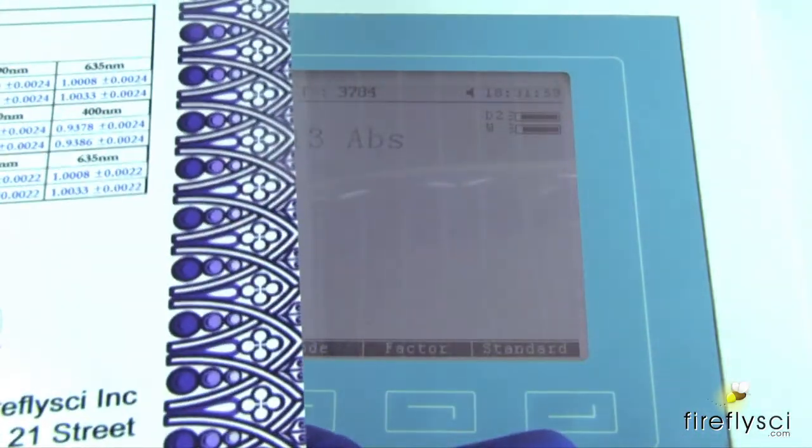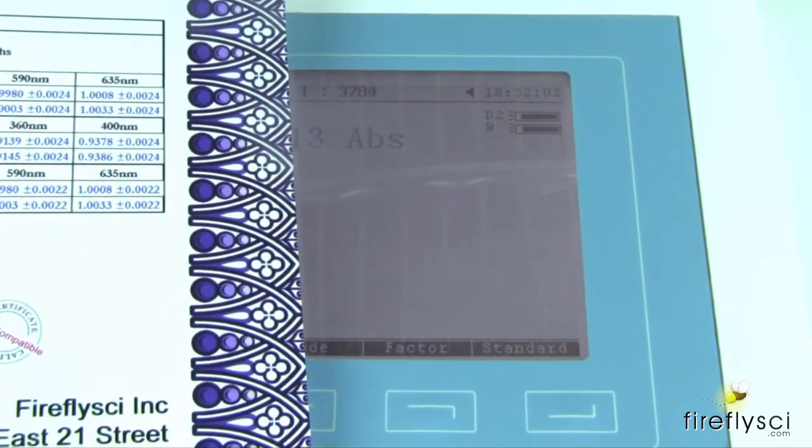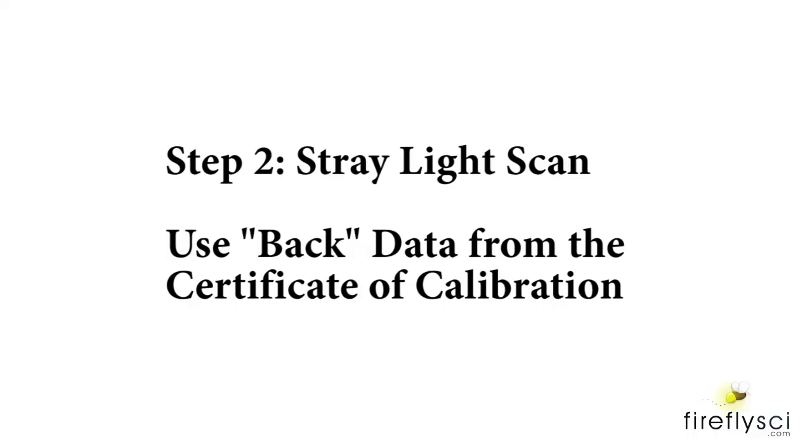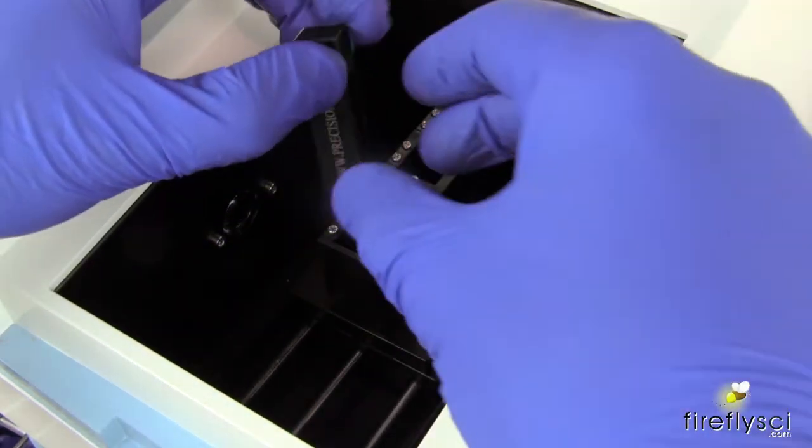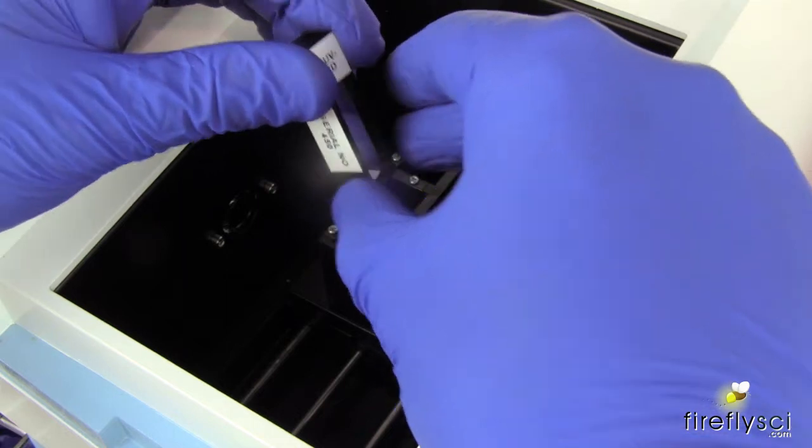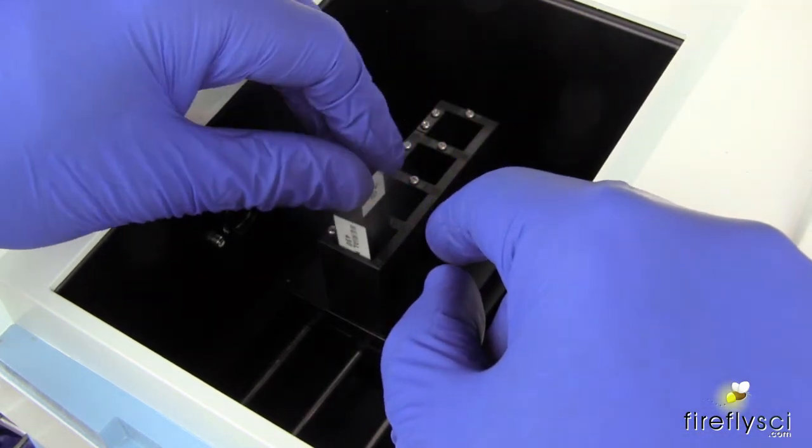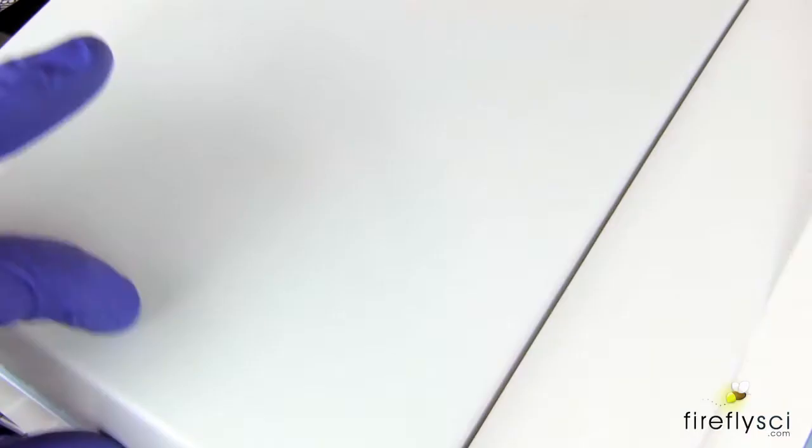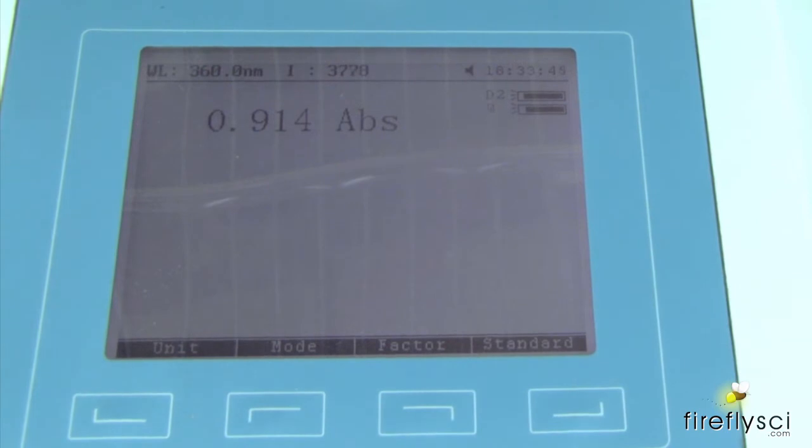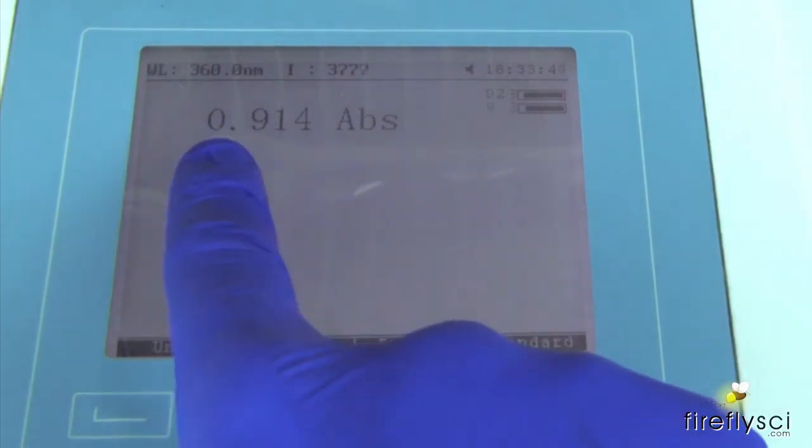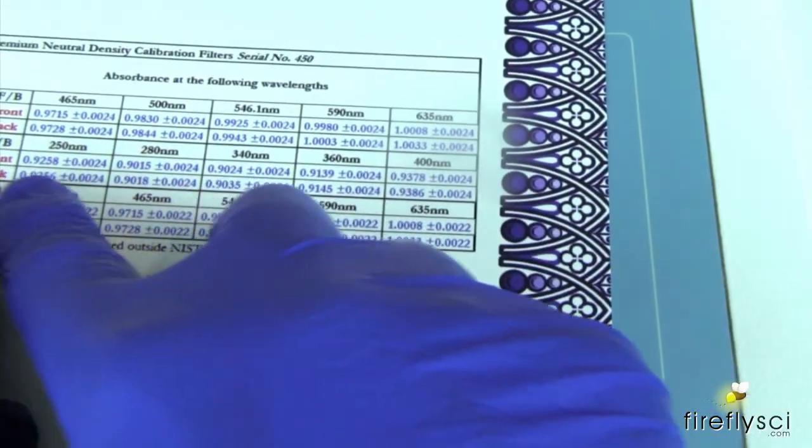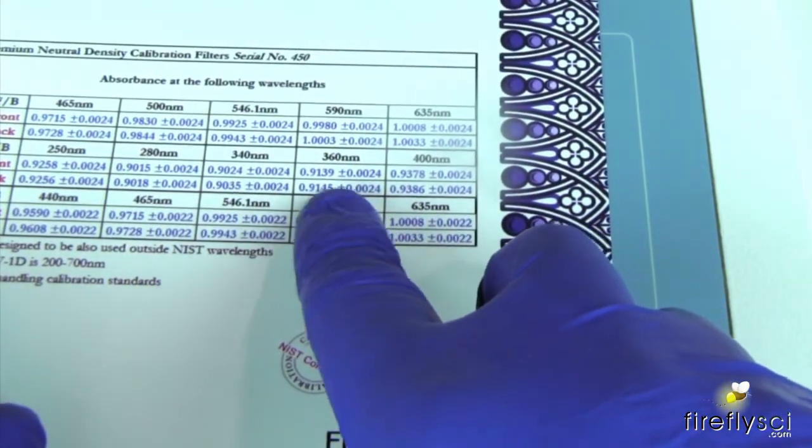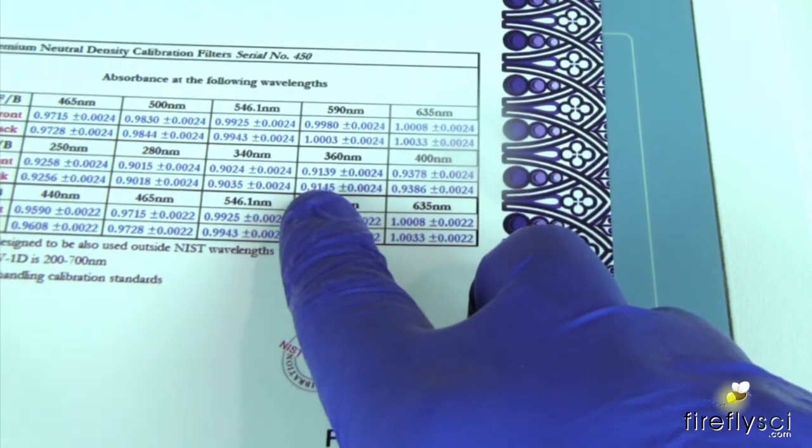So now we're ready to flip the filter over and test the back side to get the stray light. Okay, so now we'll rotate the filter 180 degrees so the white dot is no longer facing the light beam and it's facing away from the light beam. We'll put it back in. Not making any adjustments to the spectrophotometer, close the lid and we'll take the reading. Okay, and here's our reading from the back scan which is 0.914 and let's put it on the certificate again. So now we want to look at the back scan. So we're just going to look at here back 360 nanometers and again 0.914 which is perfect.